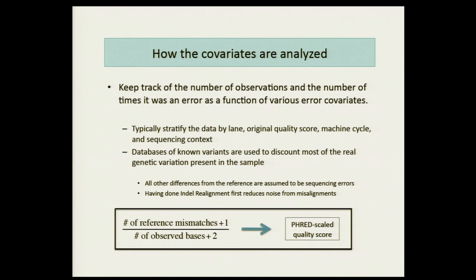I wonder if, whoa, that's loud. I wonder if people do put in some kind of control DNA to assess the exact parameters for the error in a specific lane, just a 1 or 2%. How much control DNA would you need to do something?